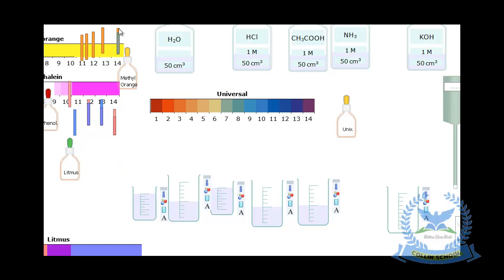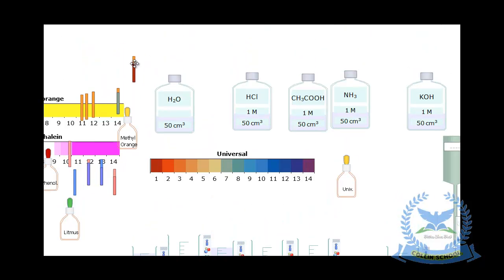Okay, let's take another, dip it over there, match it. As you can see, it takes us to the pH value of 1. And if you remember very well, this is hydrochloric acid.